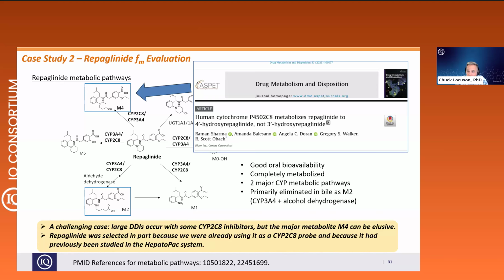So a possible explanation for this could be greater than expected contribution of glucuronidation. Again, we're speculating here, but I want to be clear that we didn't think that this was due to inadequate inhibition, based on what Ting showed you and how our inhibitor conditions were actually quite effective at suppressing the various pathways we're trying to monitor here. Okay, next slide.